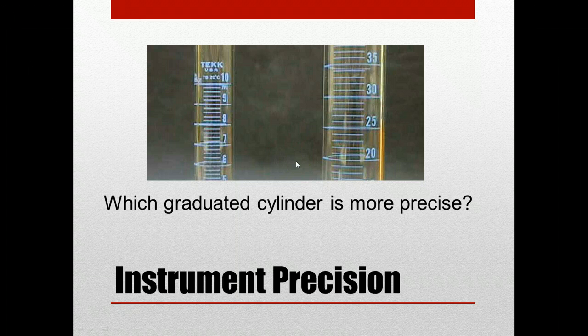Take these two graduated cylinders, for example. This is a 10 milliliter graduated cylinder. You can see that because the numbers go up to 10. This mL right here stands for milliliters. This TD 20 degrees Celsius tells you that it's going to have a total delivery at 20 degrees Celsius. So that's where this is most accurate, at 20 degrees Celsius, which is a little bit below room temperature. But the accuracy isn't that far off for a few degrees either way.